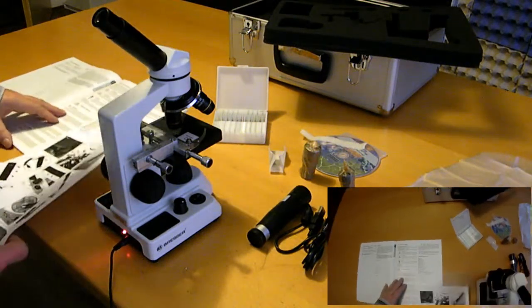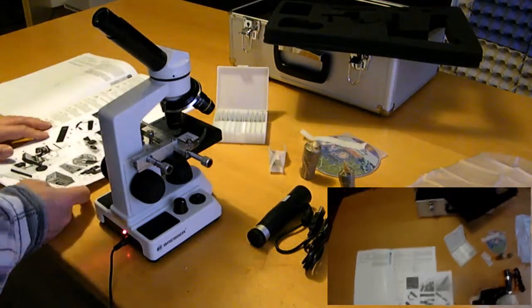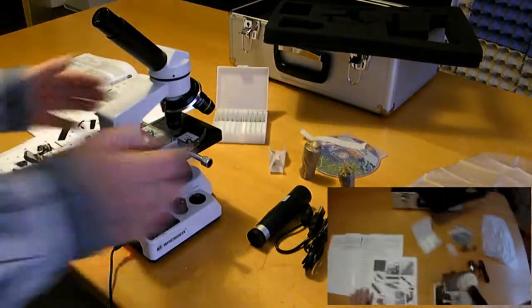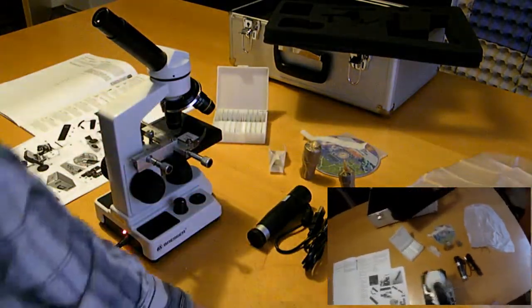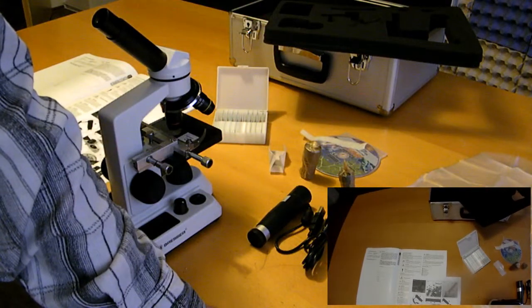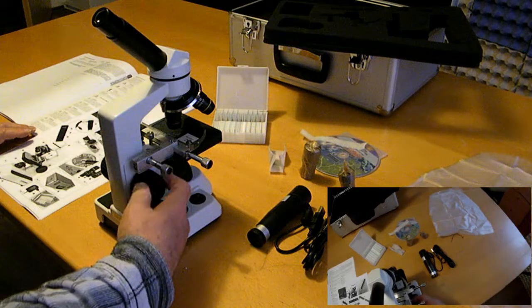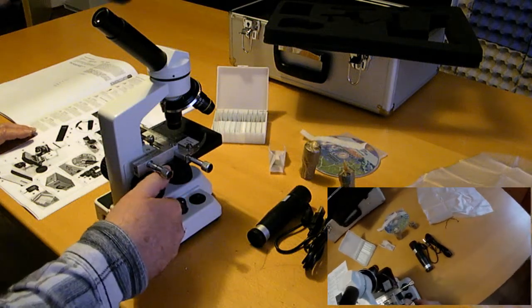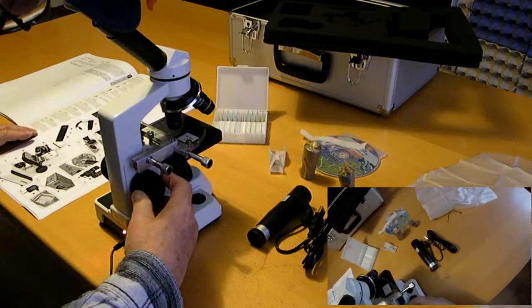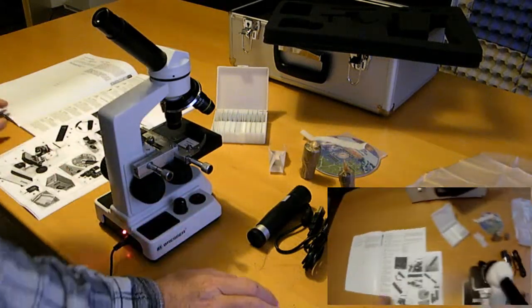Mikroskoptisch, that's a German word. Yeah, okay, this table here. I see. And the focus wheel, number 8, is here, to focus the object by turning the wheel up and down.